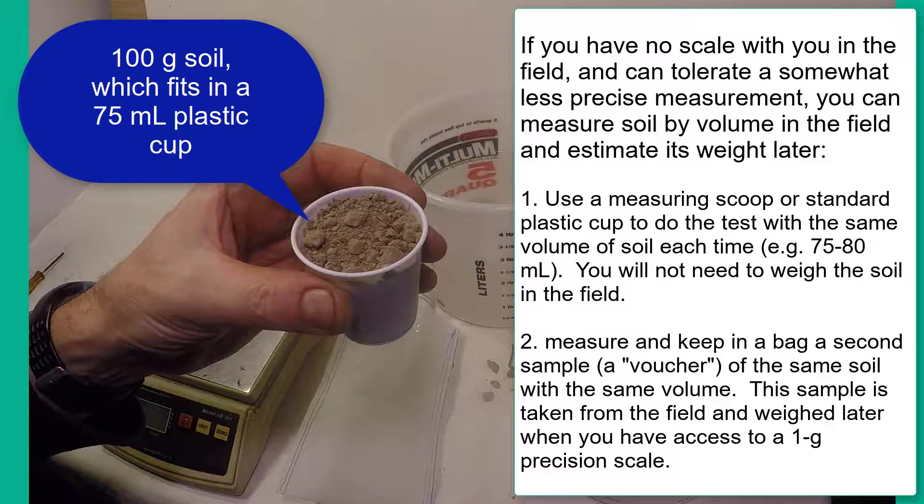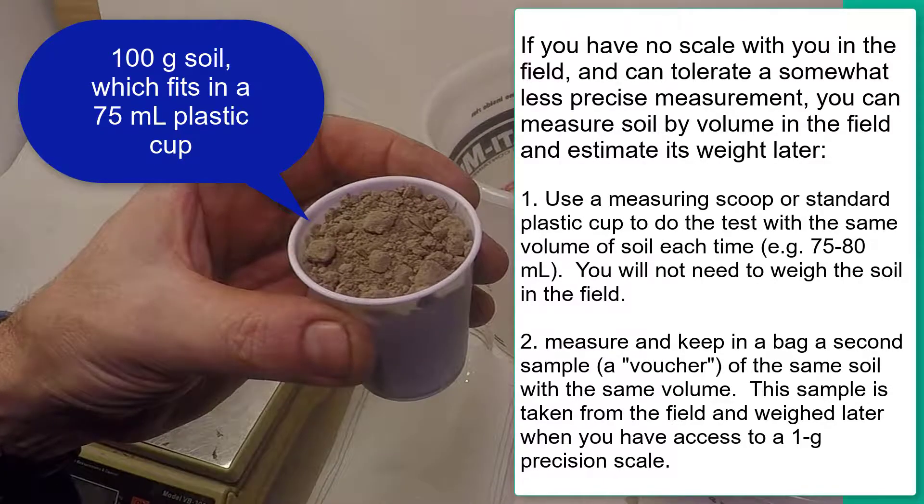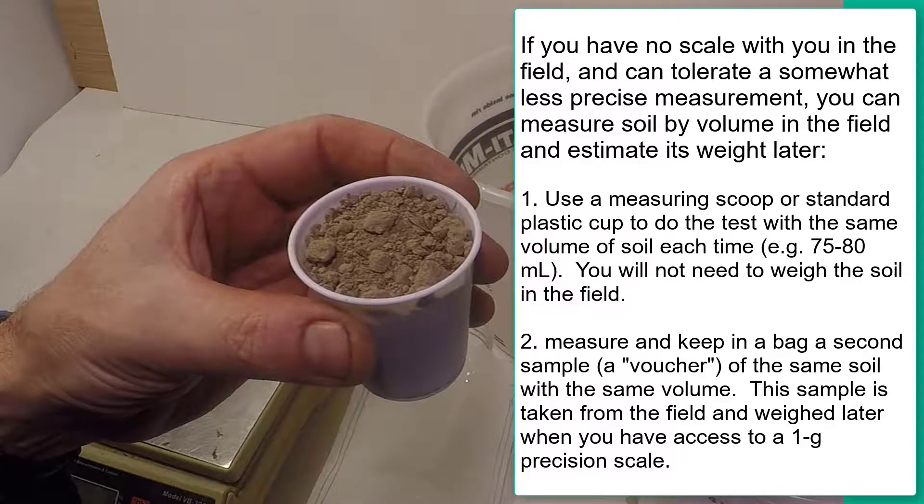Sometimes there is no scale in the field to weigh soil. In this case, you can measure out the soil by volume, and then take the same volume of the same soil in order to weigh it later when you have access to a scale.